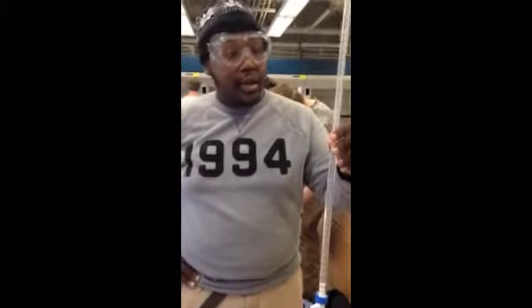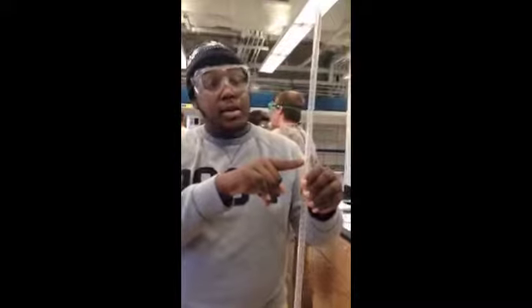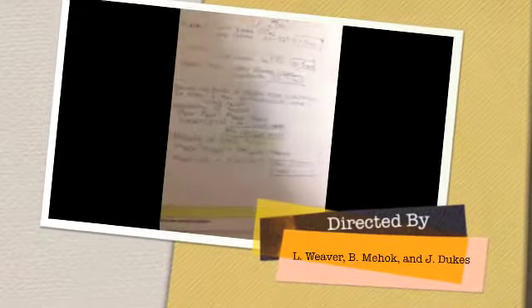74 milliliters, because we took 26 milliliters from our 50 milliliter sample of sample 1, and we got 6 left in here, as you can see by the meniscus. So we took 24 milliliters, and we have 74 milliliters as our final volume. For every 1 mole of KHP, there is 1 mole of sodium hydroxide. Here are our notebook calculations showing the molarity of sodium hydroxide and citric acid in commercial soda.